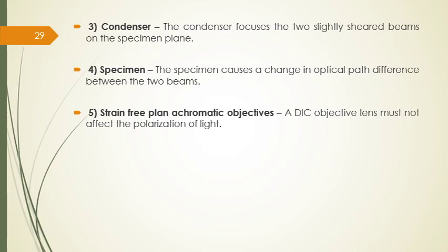The other one is Köhler illumination. Basically, it is a method of specimen illumination used for transmitted and reflected light in optical microscopy. Köhler illumination acts to generate an even illumination of the sample and ensures that an image of the illumination source is not visible in the resulting image, simply.